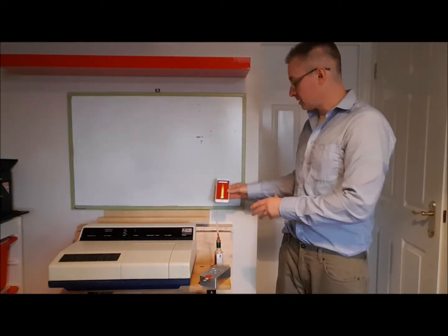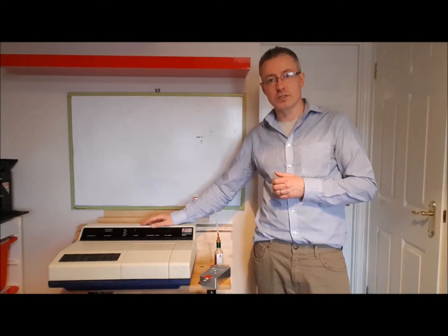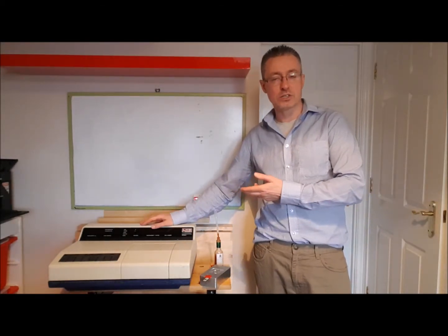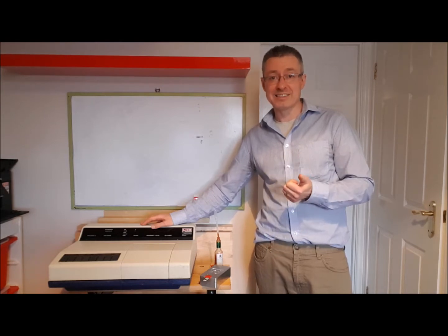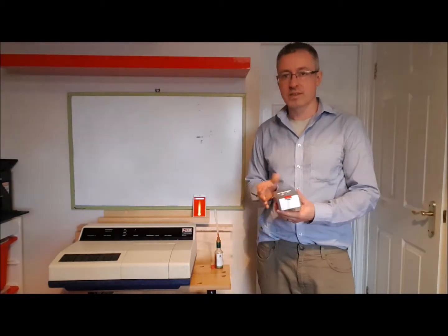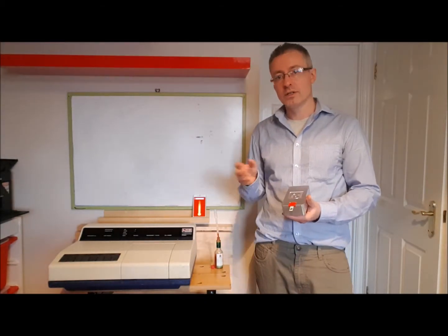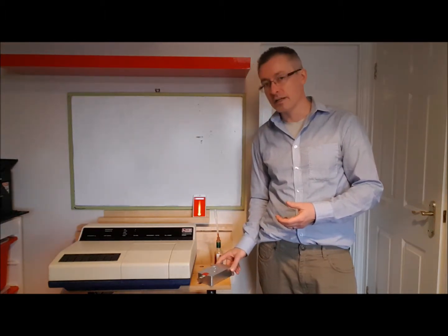What we're doing at Zimmer and Peacock is replacing an instrument that's two to three times the size of this, costs $60,000 upwards, runs at 5,000 PSI, and requires analytical grade organic solvents - with something that's small and easy to use. That's my compare and contrast between the Chili Pot Scoville meter and the HPLC method.